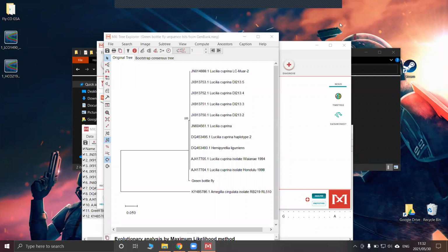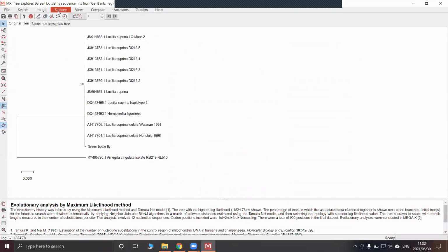Okay, so MEGA has finished analyzing the various hits and the consensus and our root, and has assigned phylogenetically the relationship between our sample and the closest GenBank hits of it. So the phylogenetic tree would look something like this. And what we can see is our root is clearly the outlier, which is what it's supposed to be. Here's our sample, here's the hits.